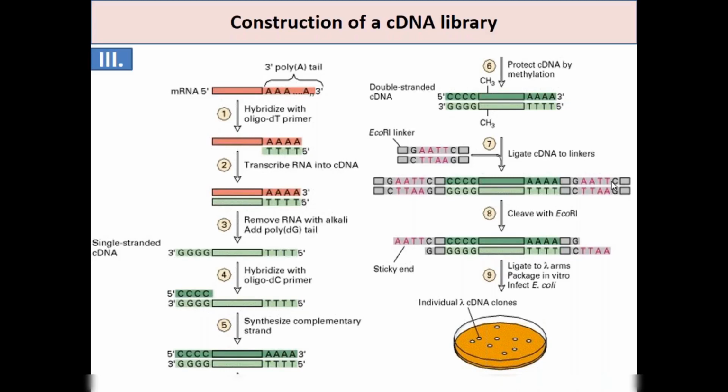That is a method, Abhishek, so that the mRNA region will be intact. If you see that, it will be TGG, and then they will add the sequence so that it will be intact.